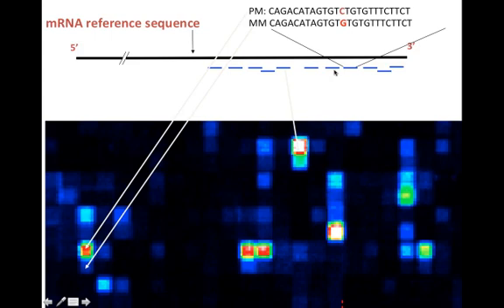Each one is 25 bases long. Here's an example: this feature here is this probe, representing this part of the gene. This is a sequence that will perfectly match. That's where the PM comes from, the reference sequence. All right, and we'll have 11 different ones, and then we'll take an average. We'll talk about that later in another lecture, about how we average these values.